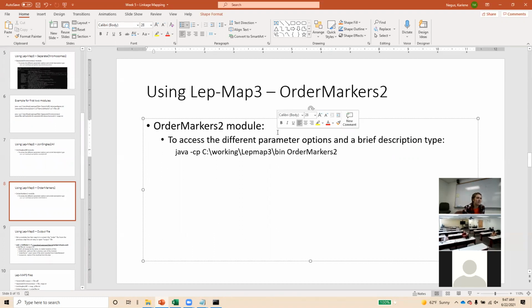So can we conclude this way today? Whatever you show here is just to confirm the quality of those markers. More like a quality control thing. Yeah, and that's the thing, with Lep-MAP, I don't run it once. I run it a bunch of times. The first couple times are quality control, seeing which markers order to the wrong groups. So you might have a marker from chromosome 3 that gets put on chromosome 5. You'll want to delete all of those, or markers that don't order well with physical positions.